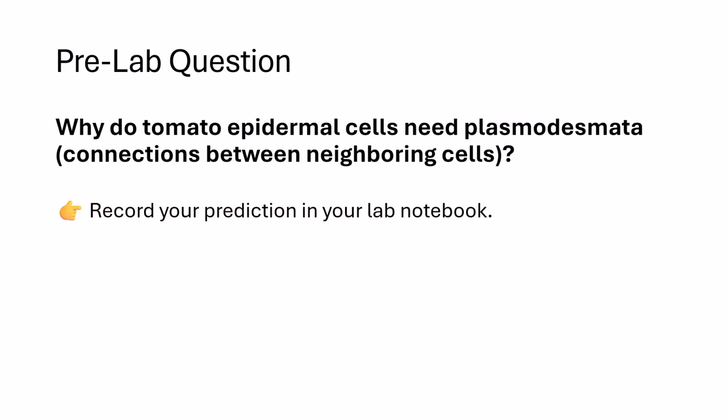Before we look at the images, pause and answer this question in your lab notebook. Think about what the epidermis does and why it might be important for surface cells to share information or materials with the cells next to them. Go ahead and pause now, then come back when you're ready.